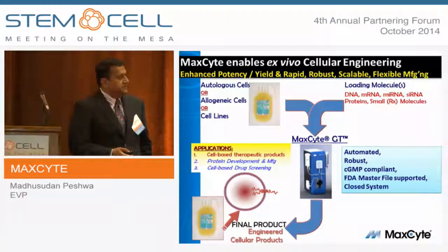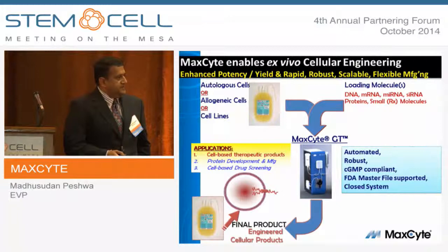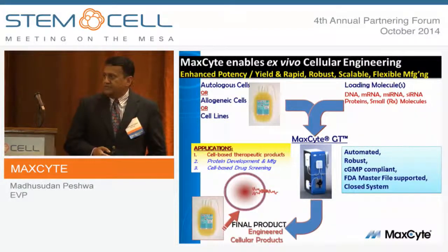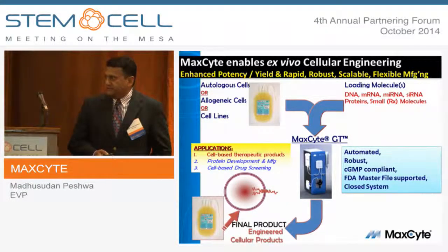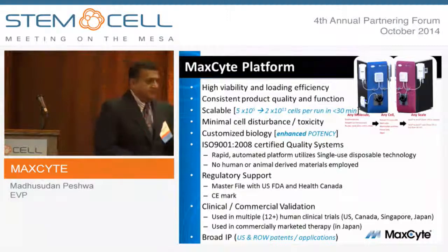The cell, when used as a tool in drug discovery research, becomes a screening tool. You can take over the cellular production machinery and use it to make therapeutic antibodies or vectors or vaccines. It's a biomanufacturing application. Or when the cell is given back to the patient, it becomes a therapeutic application.